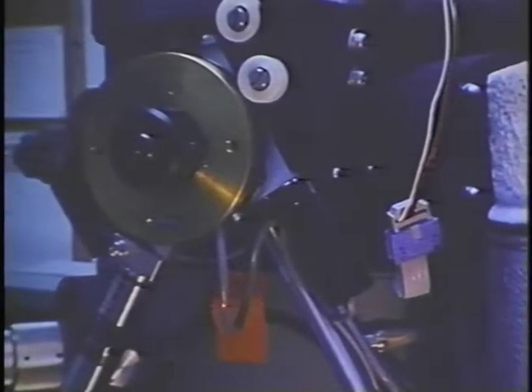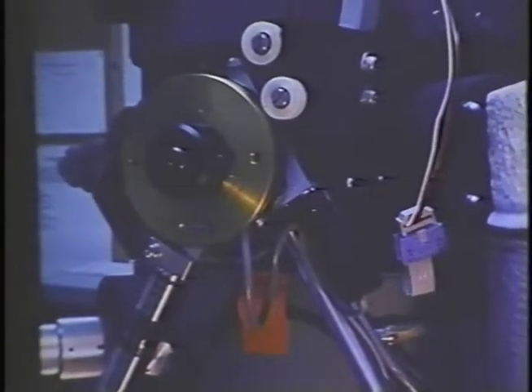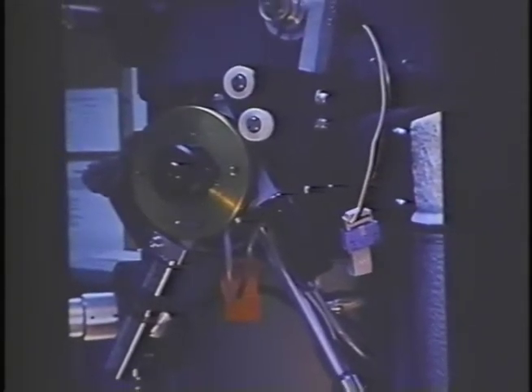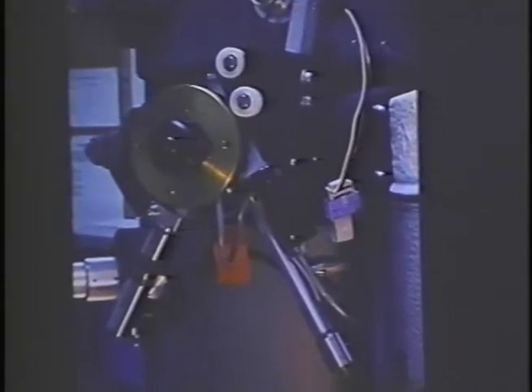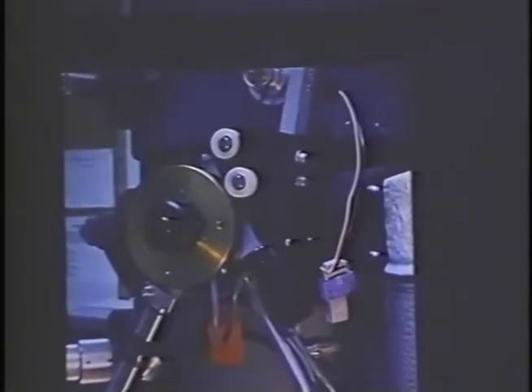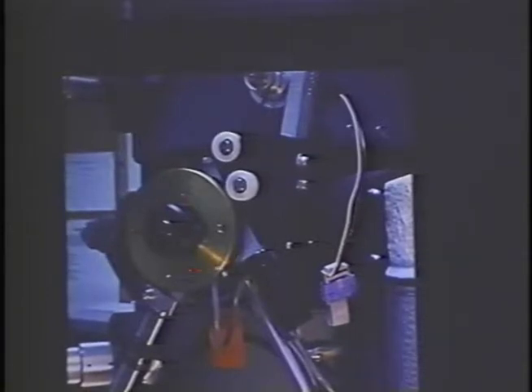In addition, another aspect, once you start thinking about collecting such a large number of views, is that you want to have an accurate way of knowing what angle you are at, and driving to the different angles. And so the system is motorized. Actually, it's an XYZ stage on the microscope plus tilt. So the normal alpha tilt here, which is motorized, is under computer control, and unfortunately it's off the screen. But what we've done is put a belt here up to a very high resolution encoder, so we can get very precise readings of the actual angular position of the microscope, and that's servoed.